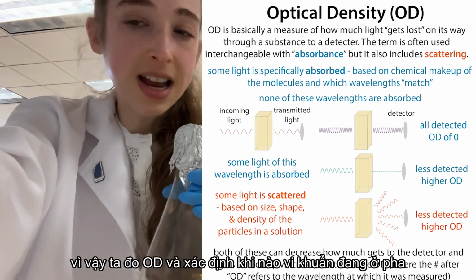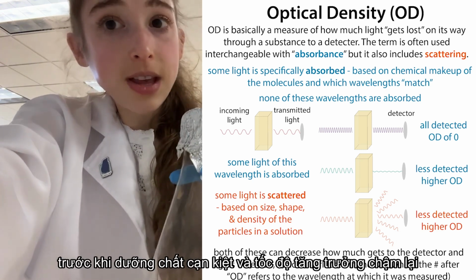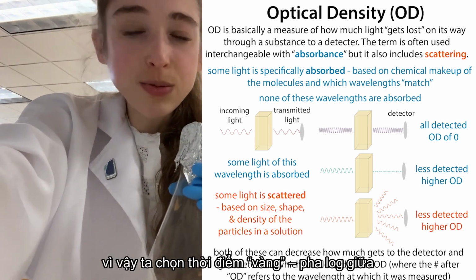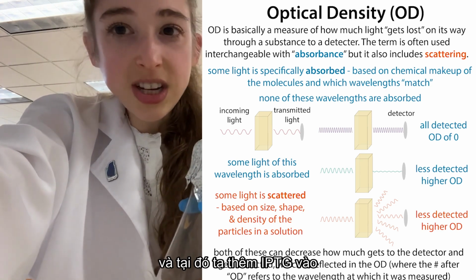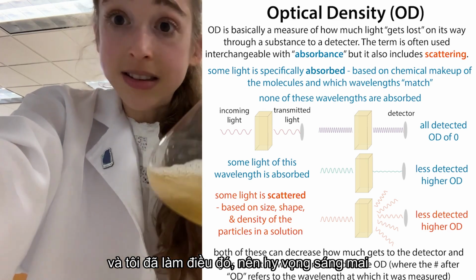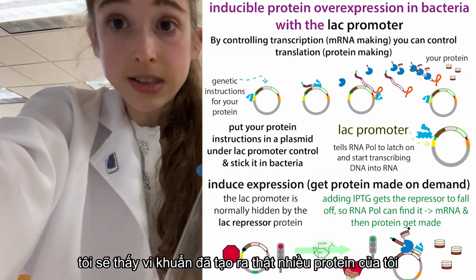We find when they're in this phase where they're doubling and doubling and doubling, but before they run out of nutrients and plateau and then start dying. So we find that sweet spot, that mid-exponential range, and then we add the IPTG and convert these into protein-making factories. And so I did that, and hopefully in the morning I will see that the bacteria have made lots of my protein.